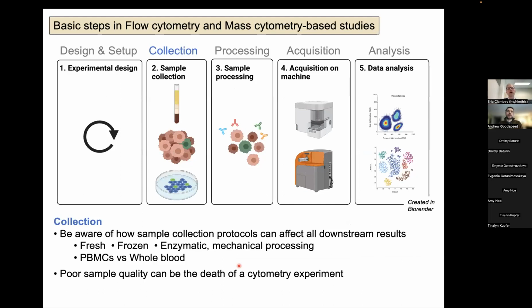So in terms of collection, please be aware of how your sample collection affects downstream results. This includes whether you're running your samples fresh, which sometimes is possible, more often in the context of animal models, or whether you're using frozen material. How you're freezing those samples is critical, and the consequences of enzymatic or mechanical processing.